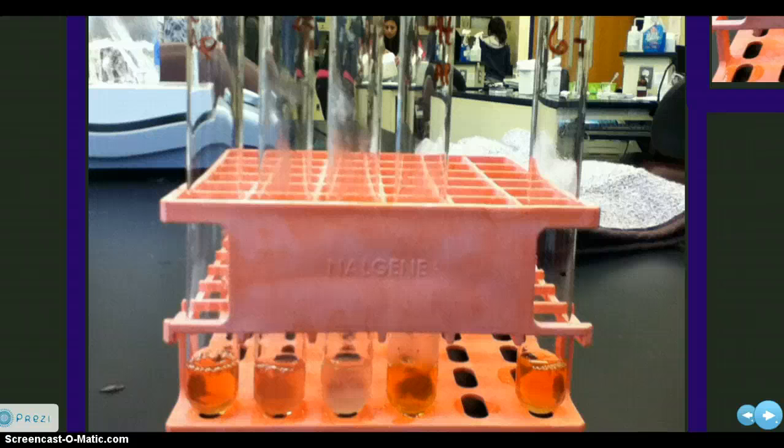Test tube 2 was at 60 degrees Celsius, and we leveled that one as a 3 too. Test tube 3 was at 100 degrees Celsius, and we can tell that it's clear, there's not a lot of change. What happened was, because of such a high temperature, the protein denatured, and the enzyme lost its structure, therefore it could not do its job. So there was no reaction to the catechol.